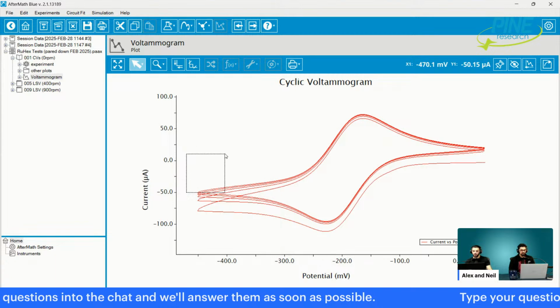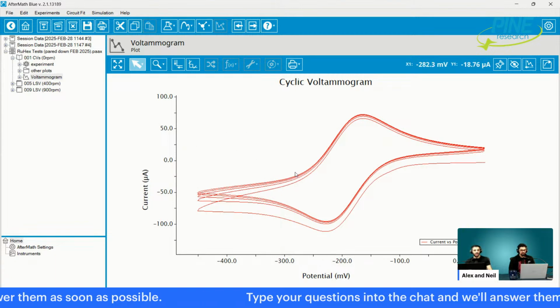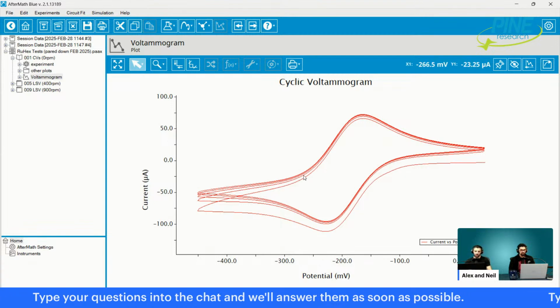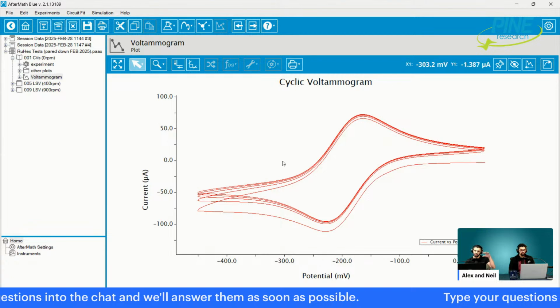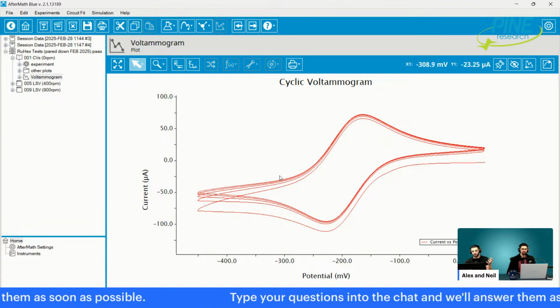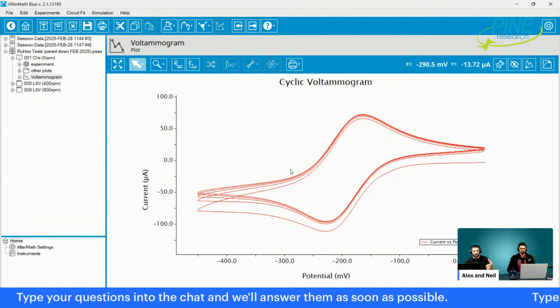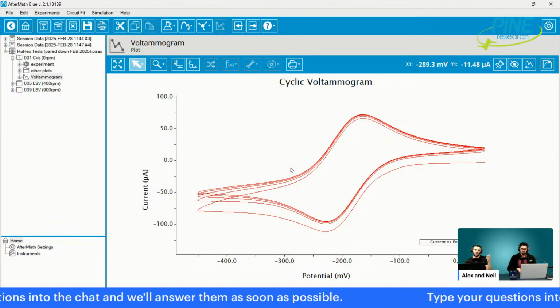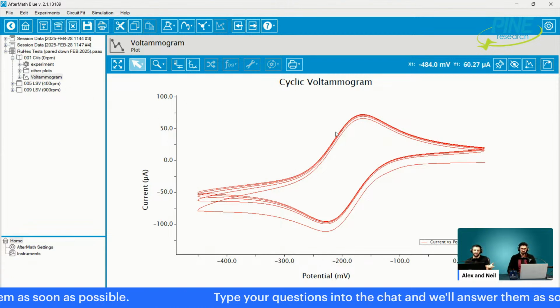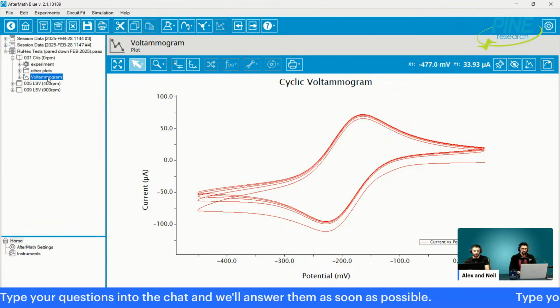And so the foot of wave is the foot where the wave starts, where the onset potential is. So whether you're talking about the reduction or the oxidation part, it doesn't really matter. The point is that's my interpretation of what Dooley's was asking. And for you, it's a similar phenomenon. I'm looking at where the current starts to shoot up or down exponentially, thus indicating Butler-Volmer kinetic type behavior. So what I'll do is I'll make a Tafel plot from a voltammogram, which is the thing I always say not to do. So here we go.